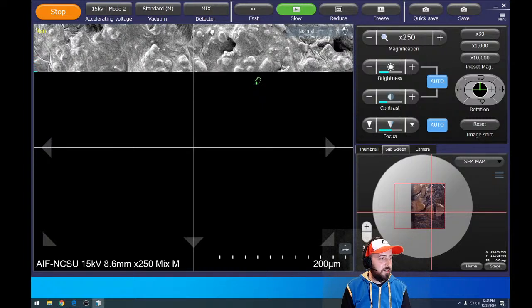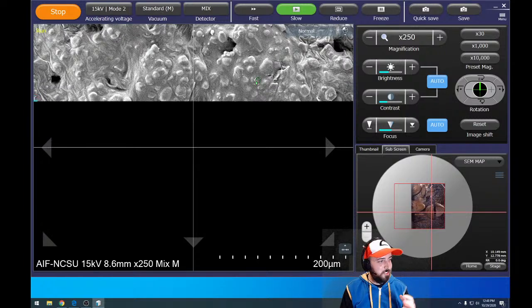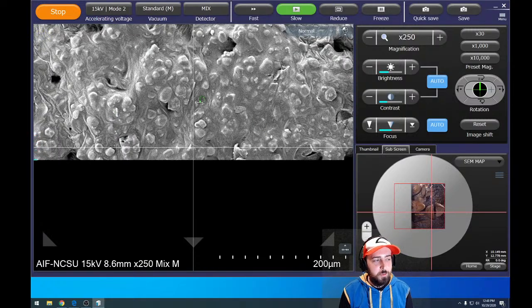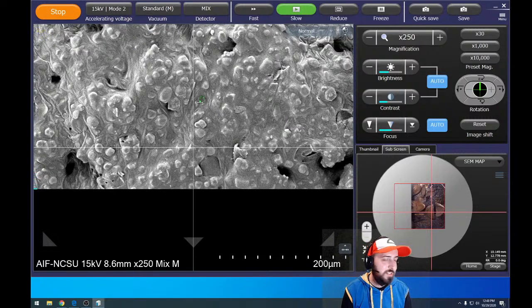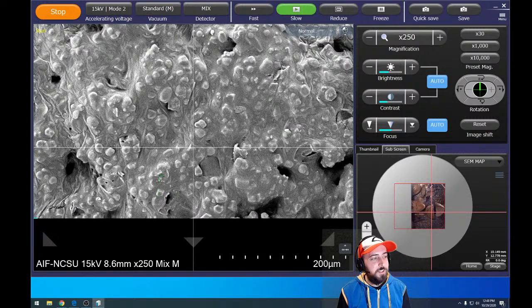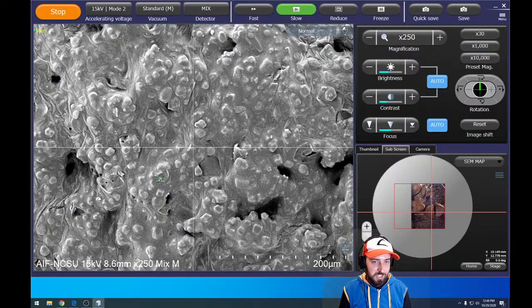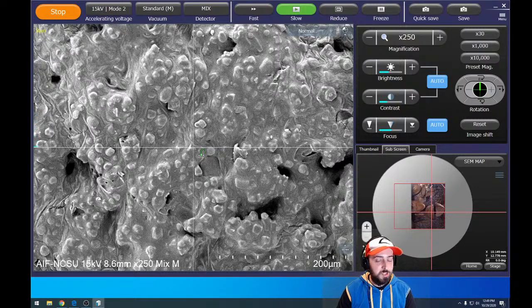Before, we saw these cracks and crevices, and to me it almost looks like a lunar surface. It looks like an alien planet ready to be explored. But now that we're zooming in a little bit more, we're seeing more of the sugar crystals that make up the marshmallow. A key point in making marshmallow is that they need very, very fine crystals to make a very smooth cream. They need very small sugar to be able to create a foam, and that's what we're looking at, these tiny crystals. These are much smaller than the sugar we were looking at, and that's really important in making a smooth cream that they can then whip air into and let expand, and then form into marshmallows like we know them today. And it's the same thing that goes into the candy corn, but they add that glaze on top.